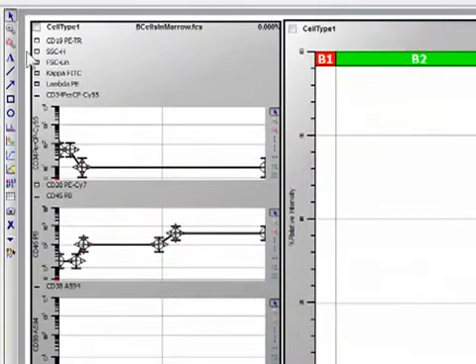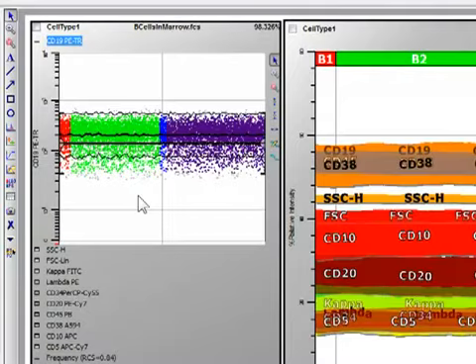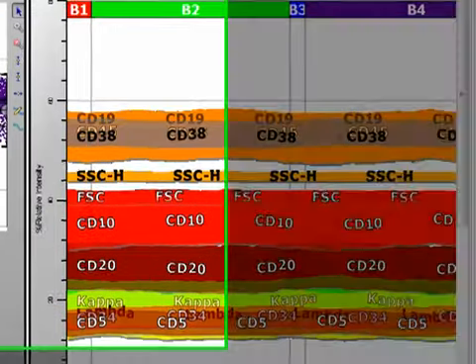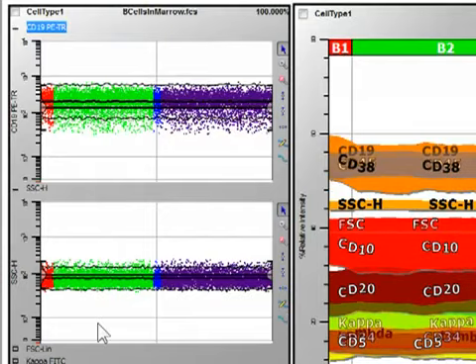That it did. The next thing that Sam did was he turned on CD19 in order to see just B cells in the bone marrow. So I'm doing that right now. Okay, and I'm seeing our bands are back, but they are all horizontal bands in our overlay. That's correct. They'll continue to be horizontal, Ben, until we actually start looking at measurements that vary as a function of progression. What Sam did next was clean up the data by looking at low light scatter, which is just the lymphocytes that are now expressing CD19, and I've turned that on.